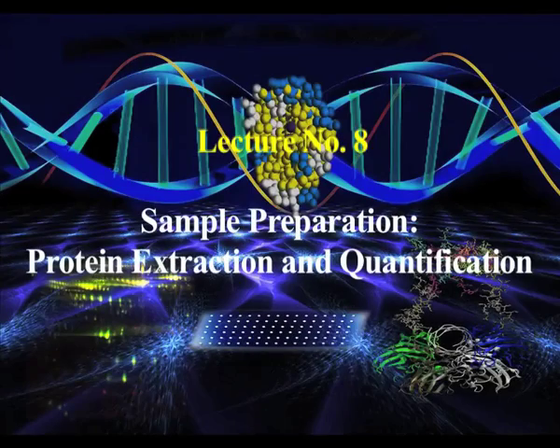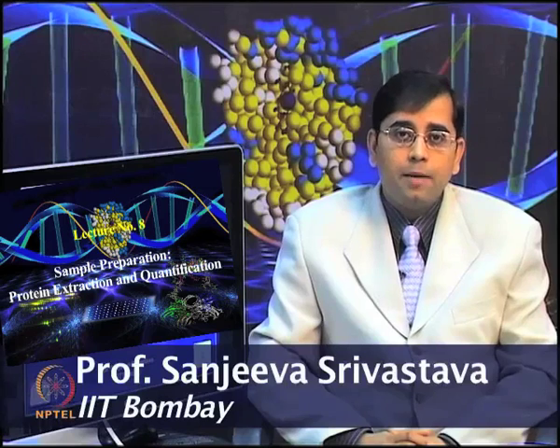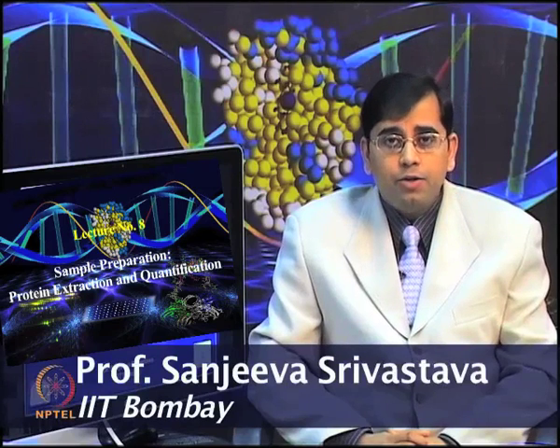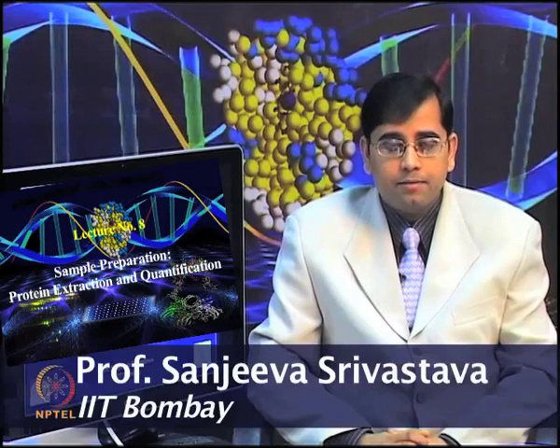Welcome to the Proteomics course. Today we will talk about sample preparation for proteomics applications with a special emphasis on bacterial proteome analysis and protein quantification. In the last two lectures, we discussed different methods which can be used for a very good protein sample preparation for proteomics applications.